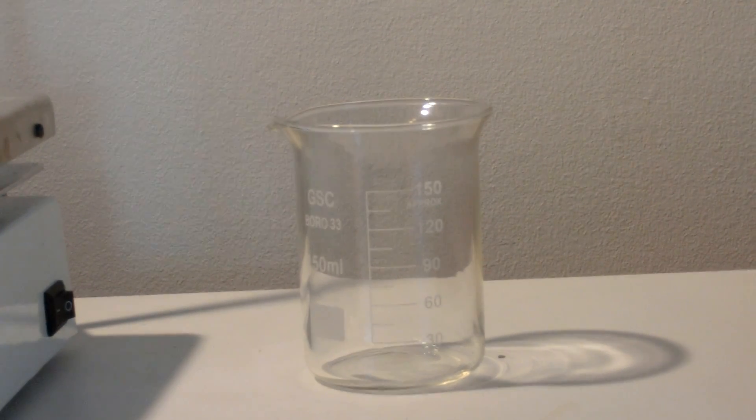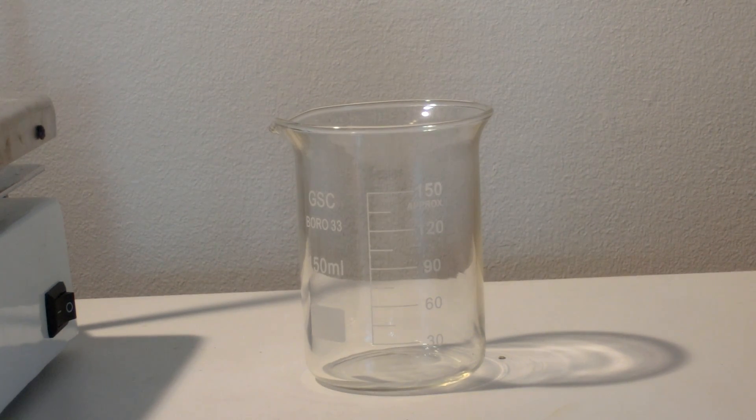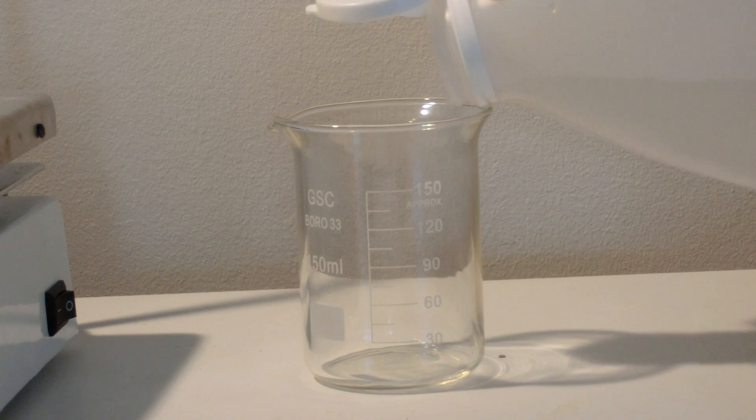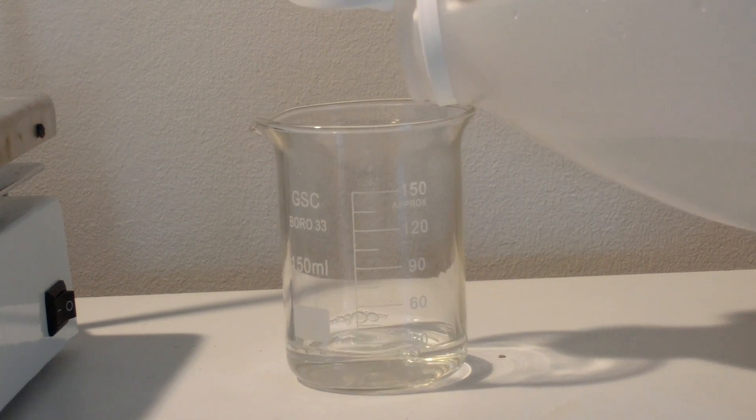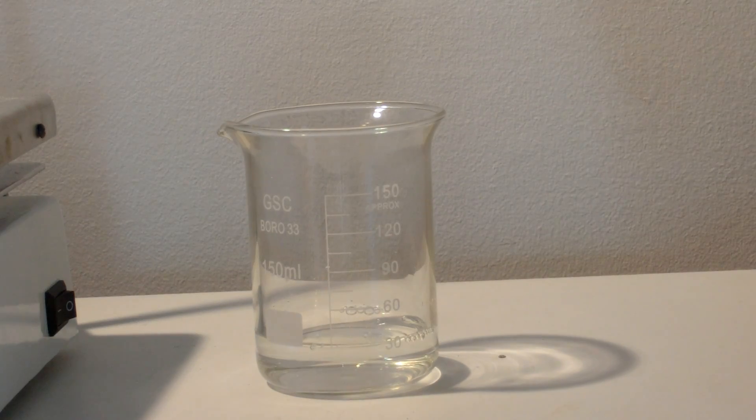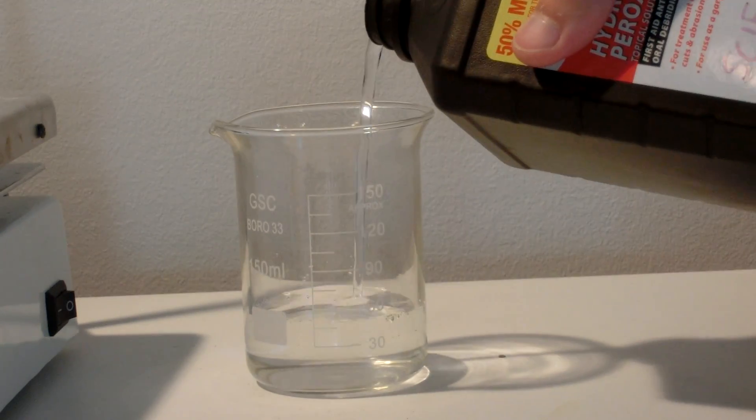Welcome to the Chemikid. In this video, we will make copper 2 acetate. To make copper 2 acetate, first measure out 30 milliliters of household vinegar, then measure out 30 milliliters of household hydrogen peroxide.